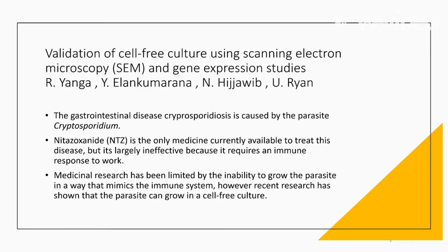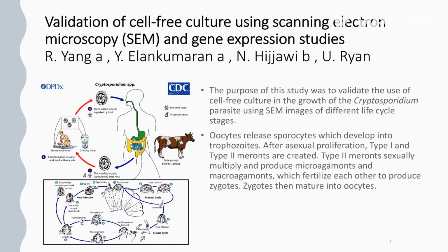However, some research showed that maybe it is possible to grow the Cryptosporidium parasite in a cell-free culture. So the purpose of this study was to prove that it is possible, and their intention is to use SEM images of different stages of the Cryptosporidium life cycle to prove that growth is occurring.